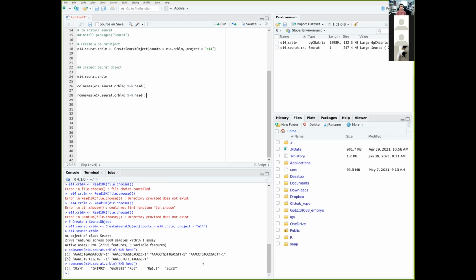We're going to identify genes which are very specific to certain functions. So having gene names will give you the ability to identify these genes quickly, as compared to providing gene IDs, which can be a bit cumbersome downstream. So I'm going to just write here to try to have gene names as feature names, for example.